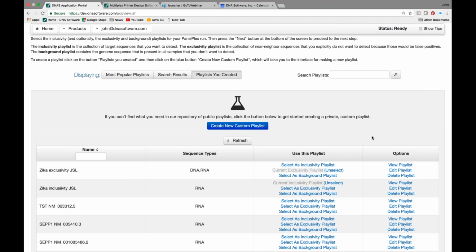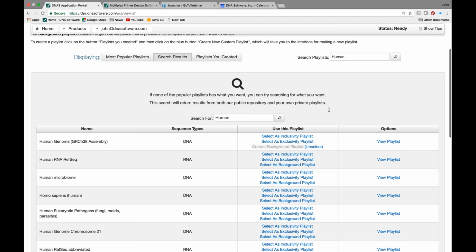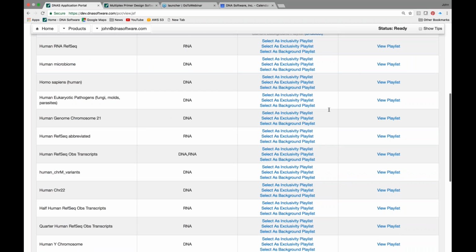All right, so we've now chosen our inclusivity and exclusivity. Last step is to choose the background sequence. In this case, I want to make sure that any Zika diagnostic I design does not bind to the human genome. So I choose the human genome as my background sequence. I just did a little search here out of all our playlists. I listed every playlist that involved humans, and here they all are. The first one on the list is human genome, so I selected that.